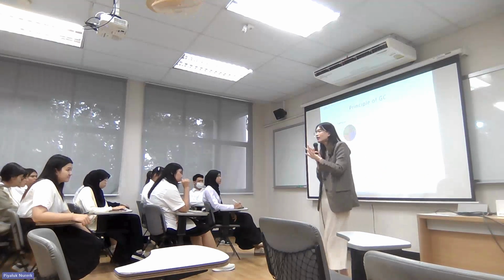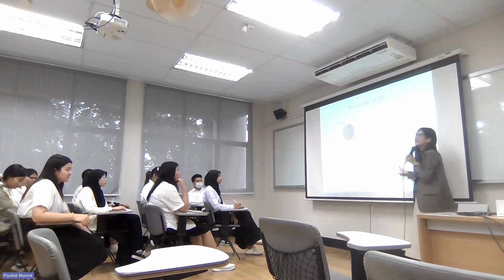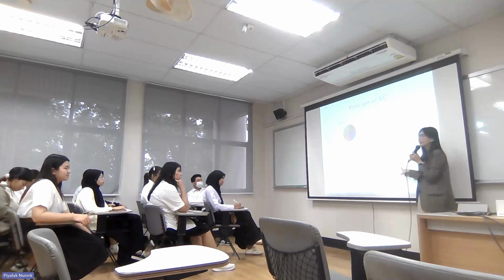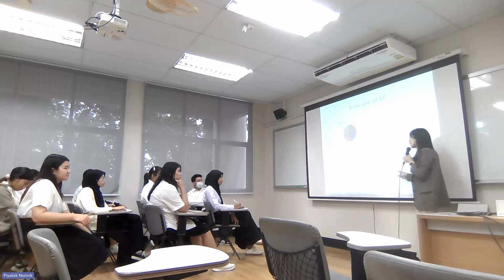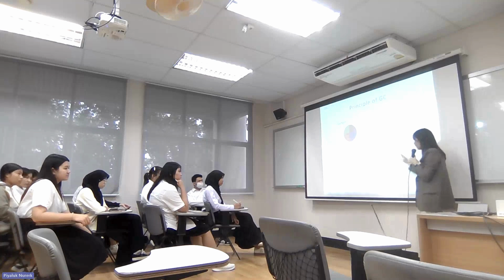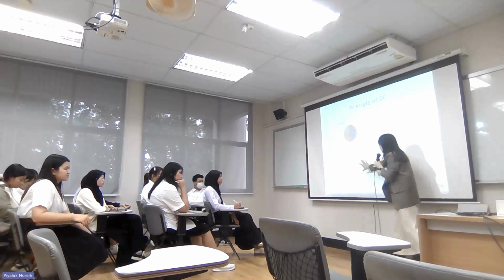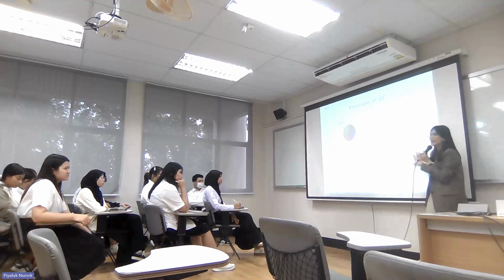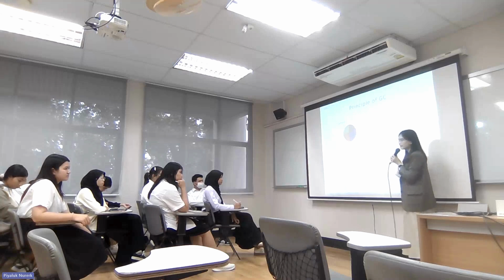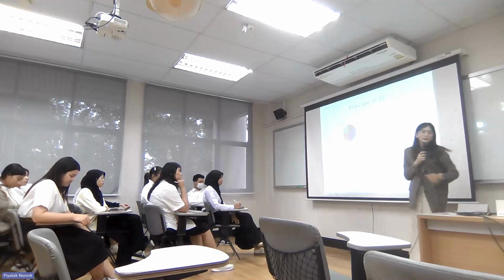Yeah. For the quantitative analysis, in this slide, you say that D is the lowest, because we can see that the intensity of D is the lowest, and also if we consider the peak area, the area of D is the lowest as well. For quantitative analysis, after the detector detects each target analyte in the chromatogram, the peak area or the peak intensity is related to the concentration of the target analyte.